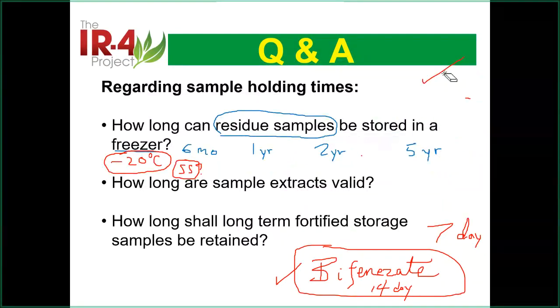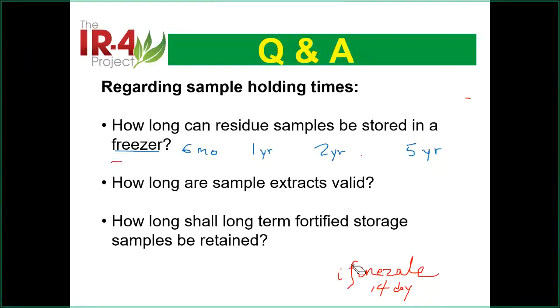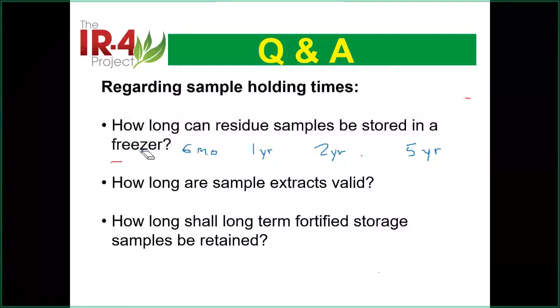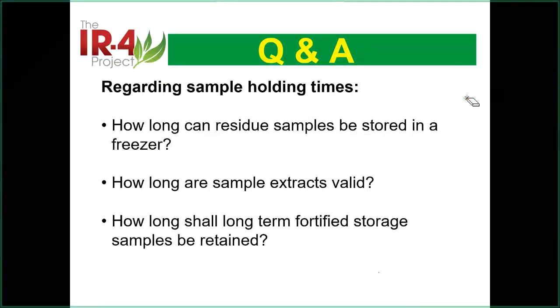Okay, the question number 2 on this slide. How long do you need to keep your sample extract in your lab, for example? I'm talking about extract, not standards. Just talk about extract. It's clean enough.